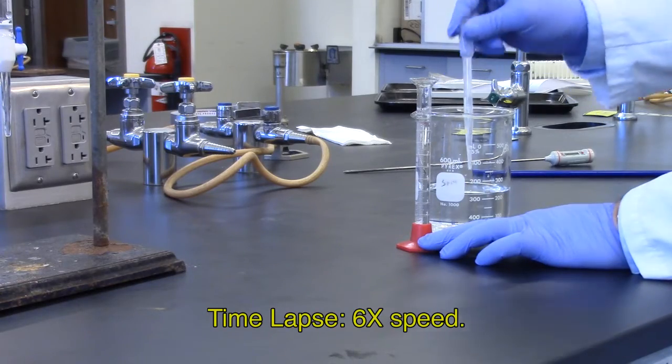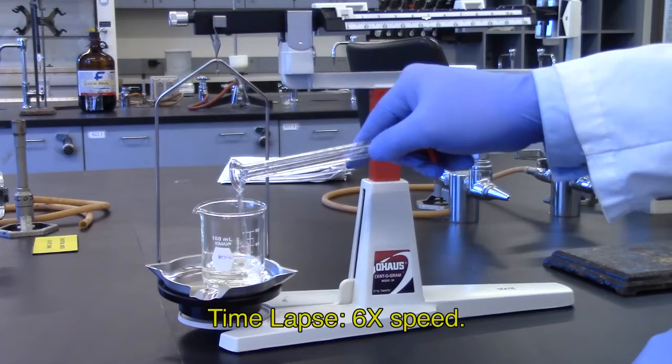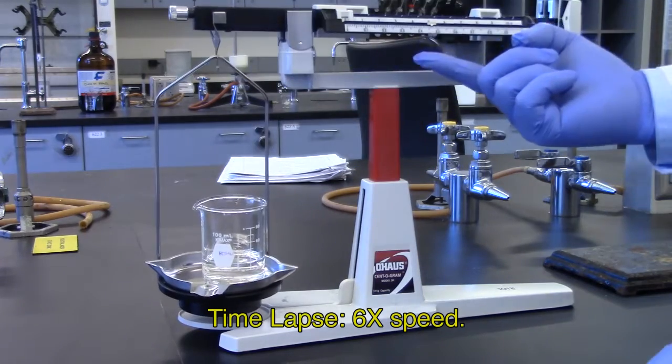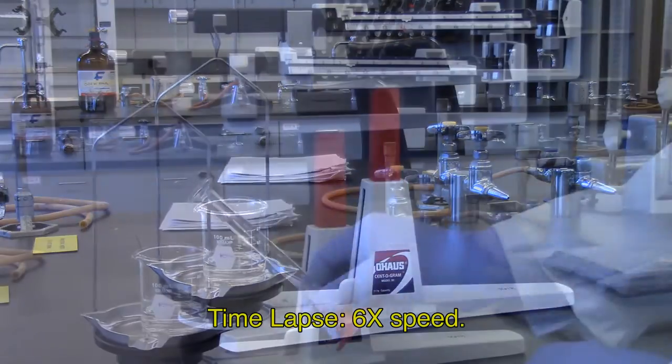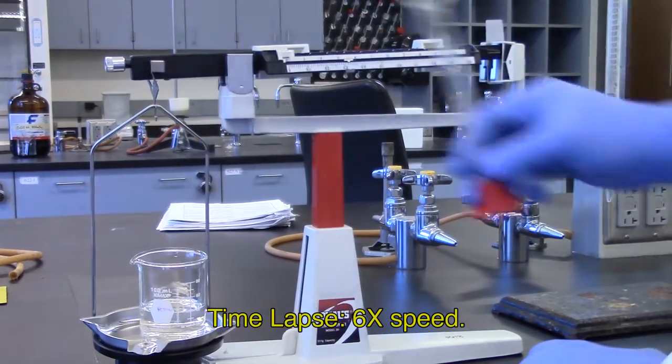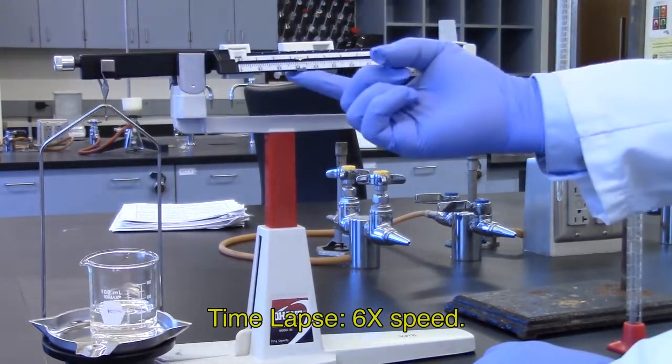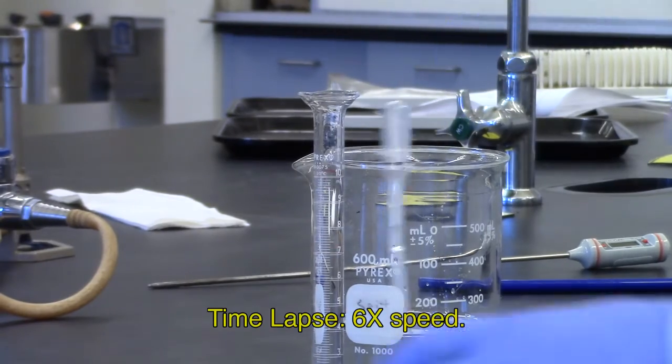Repeat four more times, measuring out 10 milliliters of water with the 10 milliliter graduated cylinder and transferring to the 100 milliliter beaker and weighing after each 10 milliliter aliquot addition.